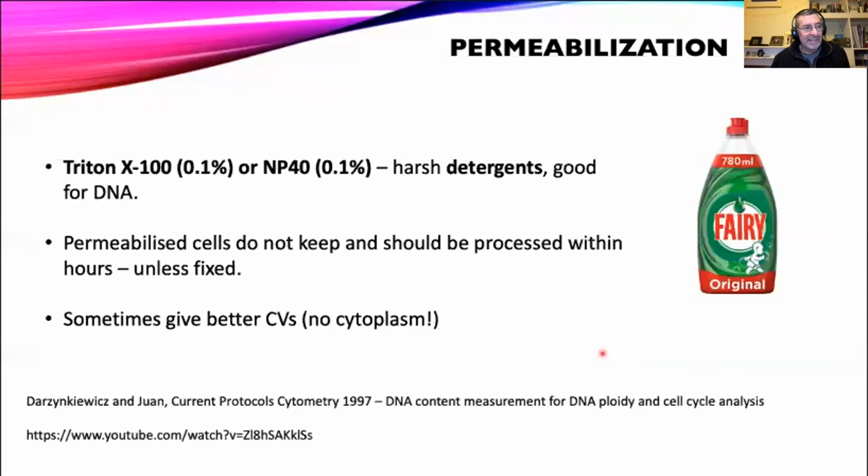One question from Priscilla that came through is, what is the difference between formaldehyde and paraformaldehyde in terms of flow cytometry? Well, that is a great question, and it's one of my biggest bugbears, because you will read in the literature and people will always say they fix cells in paraformaldehyde. This is not true. If you look at a pot of paraformaldehyde, it's a white powder. If you put it in PBS, it remains a white powder. It's insoluble.